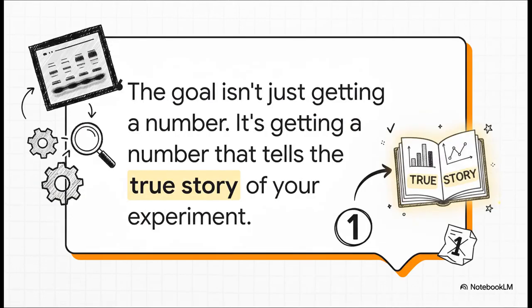So at the end of the day, just remember this. The point of all this isn't just to get a number out of our program. It's about understanding the whole process so that the number you end up with is one you can trust, a number that tells the true story of what happened in your experiments.